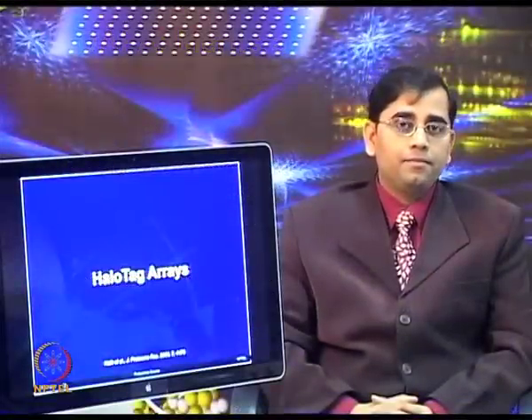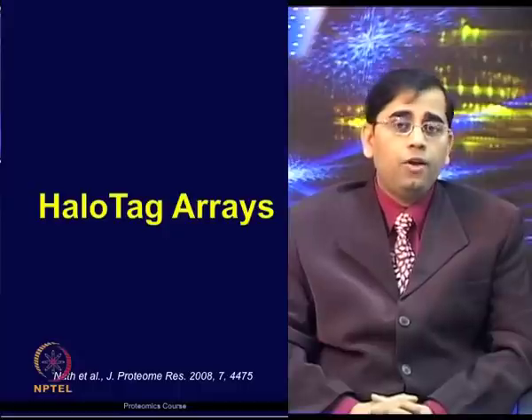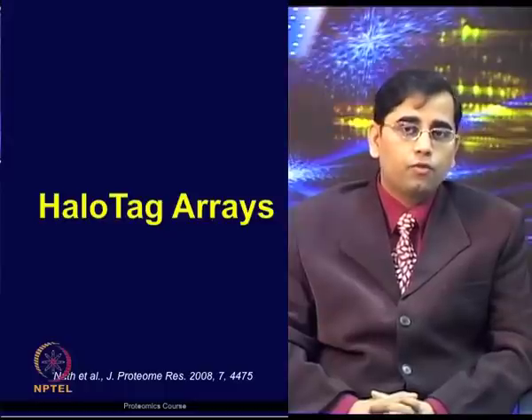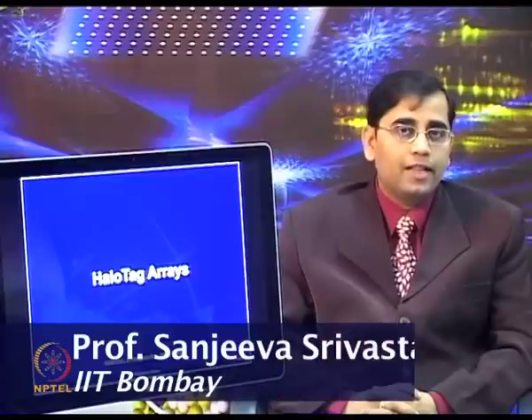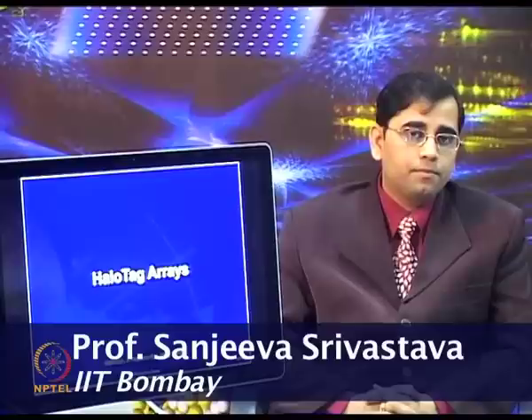So, after discussing PISA, NAPPA, MIST and DAPA techniques, now let us move on to the latest addition, HaloTag arrays. The HaloLink protein array system was developed by Promega, which combines a few technologies together to create protein microarrays. First of all, it uses a cell-free transcription and translation expression system based on wheat germ extract.